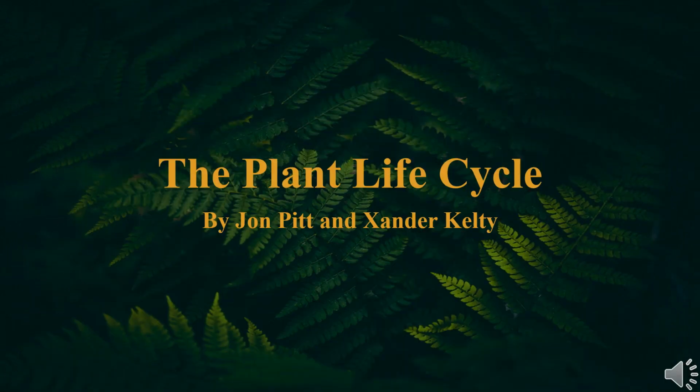Hello, everyone. Today I will be walking you through the process of growing full-sized ferns from spores, exploring the unique life cycle of these plants.